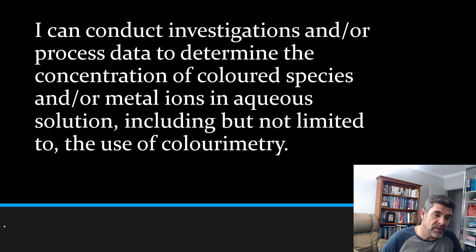And one of those, of course, is not limited to, so we need to make sure we look at a number of these different types of techniques. But one of the ways of determining the concentration of colored species or metal ions in aqueous solution is to use the technique of colorimetry.